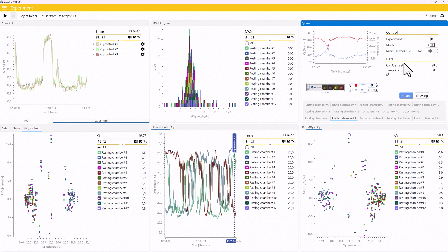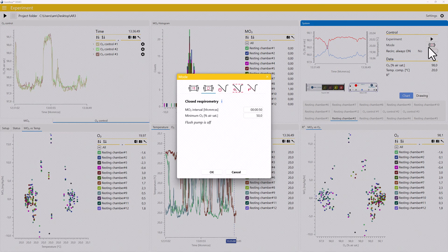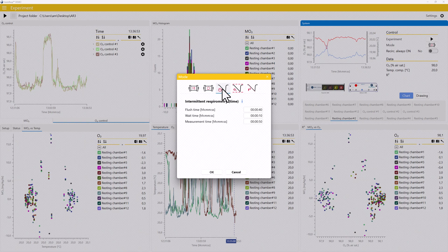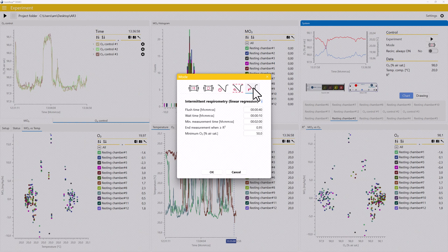New respirometry modes have been introduced. You can now run intermittent respirometry trials based on time, minimum and maximum oxygen levels, or minimum R-squared values.